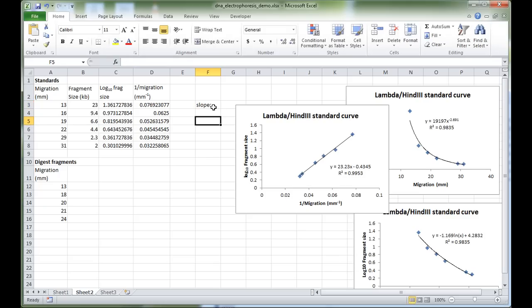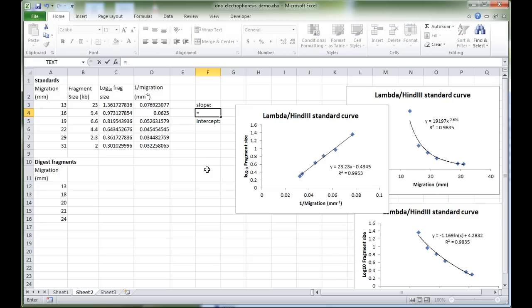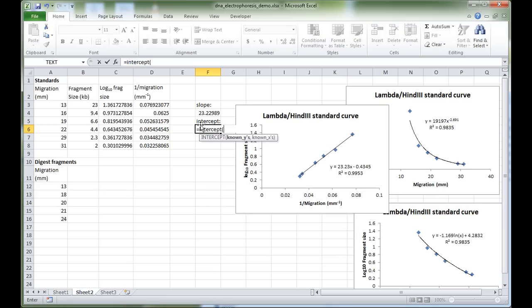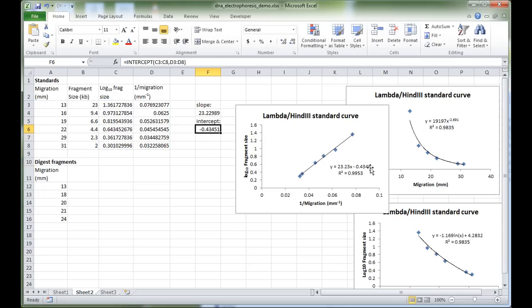To calculate the slope, use the Excel SLOPE function: '=SLOPE(', with the known y's being the log₁₀ fragment size column, then a comma, then the x's being the 1/migration column. Close the brackets and press Enter — it gives 23.23 with several decimal places. For the intercept, use '=INTERCEPT(', feed it the y-values first, then a comma, then the x-values, close the brackets — and it gives the intercept value as well.